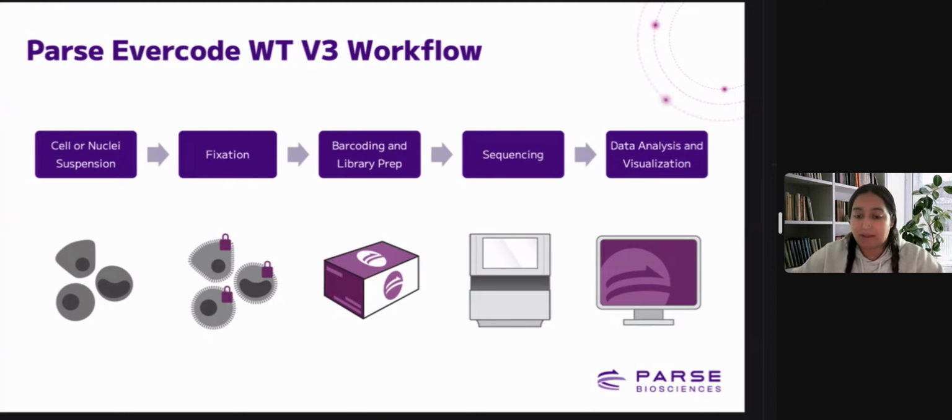In addition to trypan blue, I would recommend you at least take a look at what they look like, how their membranes are. We don't want to see any fading or blebbing membranes while we fix them, because as we barcode, as we go plate to plate, we'll lose the ones that are weak. When we fix them, we both fix and permeabilize the membrane. So we want to make sure that going in we have strong, robust membranes.